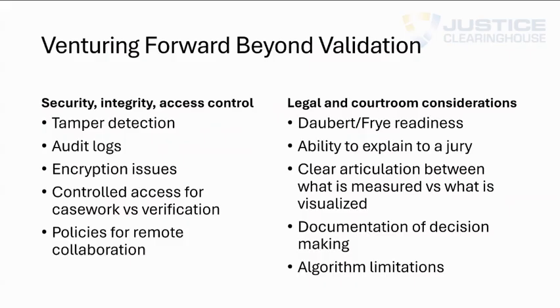And then security, integrity, and access control. We have to look at tamper detection. We have to consider audit logs and encryption issues. We need to consider controlled access for casework versus verification. And we should have policies in place for remote collaboration, not only between laboratories of the same laboratory system, but also different laboratories. Because this is a wonderful instance now where single examiner laboratories can have potential verification from another single examiner laboratory. But how are we going to manage that?